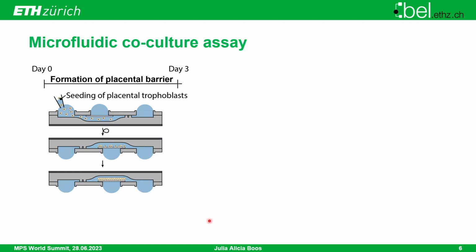Yeah, we designed the entire microfluidic assay in a way that we first formed the placental barrier in our microfluidic device before we established the co-culture. That means we first seeded the placental trophoblast cells into the maternal compartment of the chip. We flip the chip upside down to a hanging drop configuration so that the cells can sediment and adhere to the semi-permeable membrane and form a tight placental barrier within the first 3 days of the assay.